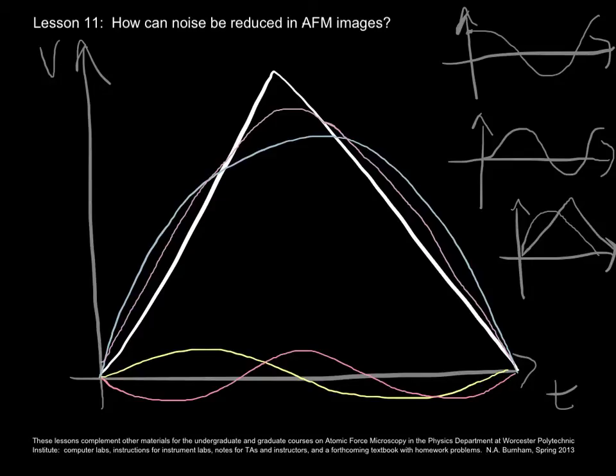It turns out we keep on doing that, and it's only odd multiples of that original frequency. So the fundamental, and then 3 times, 5 times, 7 times, and so forth. Those multiples are called harmonics, and when you have only the odd ones, you have the odd harmonics. So if I were to draw the Fourier transform of a triangle wave, I'm going to draw it in the middle here.